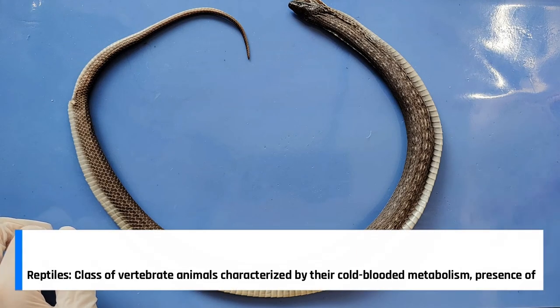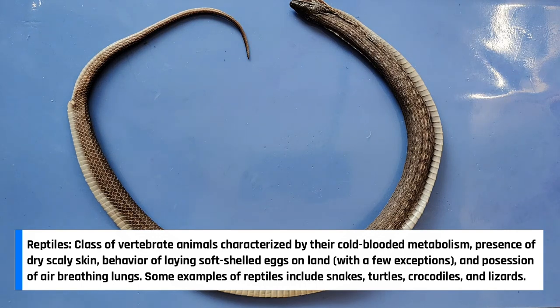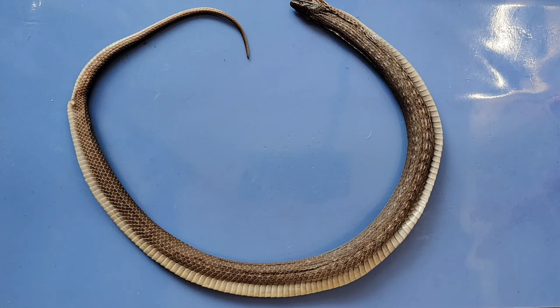Reptiles are a much larger group of animals that are adapted for living and reproducing on land. While some species might spend time in water, most reptile species spend the majority of their time on land. Some other species of reptiles include turtles, lizards, crocodiles, and alligators.